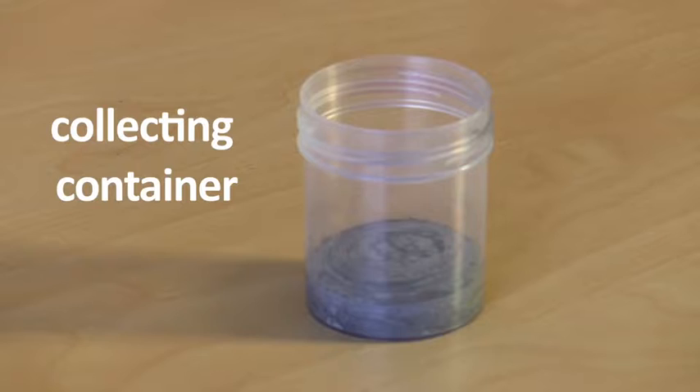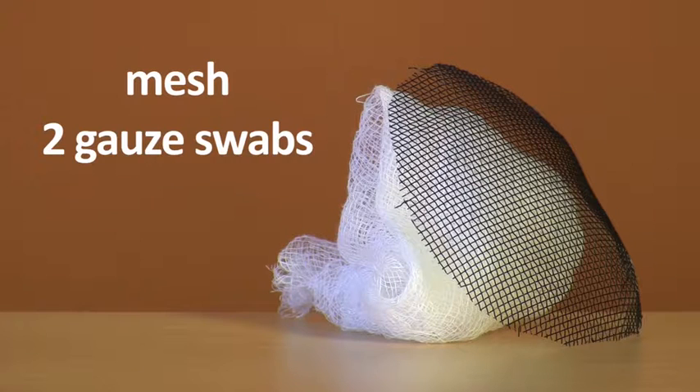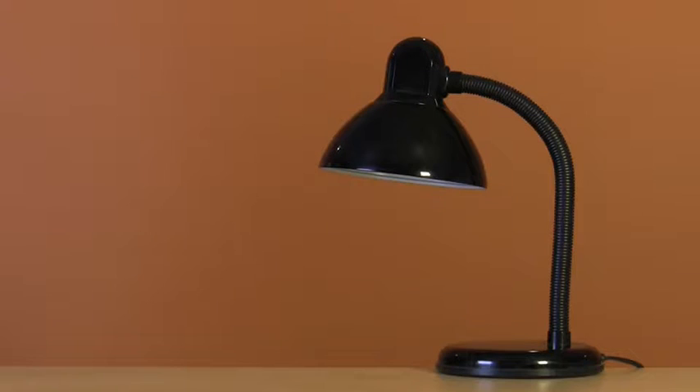The great thing about this apparatus is that it's really easy to set up and can be made using everyday objects. All you need is a collecting container, a 1.5 litre plastic bottle, mesh and two gauze swabs, and a lamp.